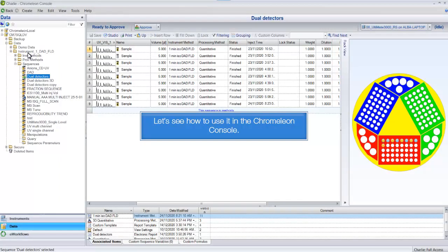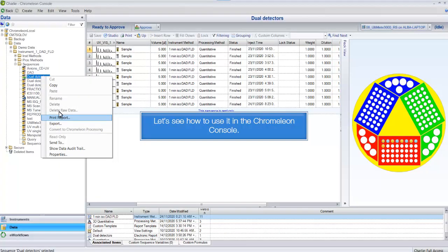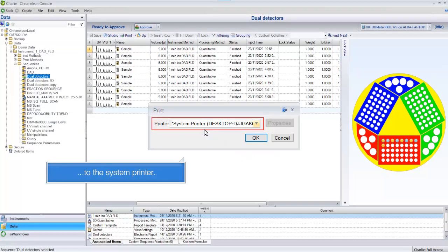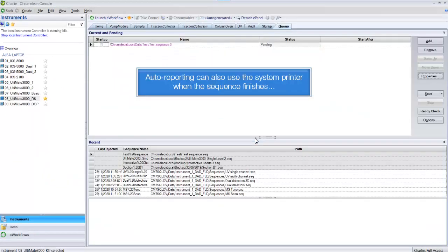Let's see how to use it in the Chromelion console. Change from the local printer to the system printer. Auto reporting can also use the system printer when the sequence finishes.